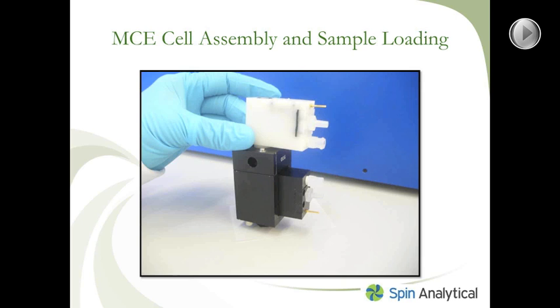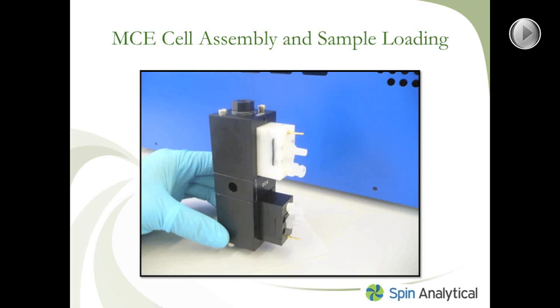The last step is to take the top buffer clamp, place it over the buffer chamber, and then connect it all with the screws — the remaining two long metal screws, the remaining hex screw, and the remaining peak plug.